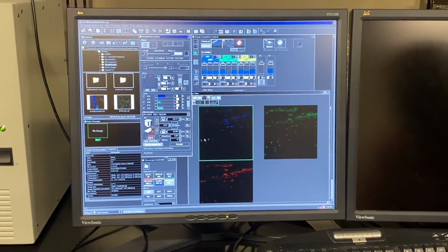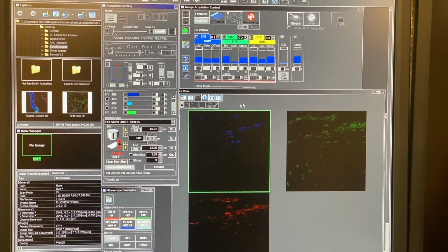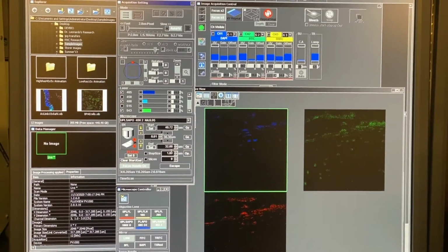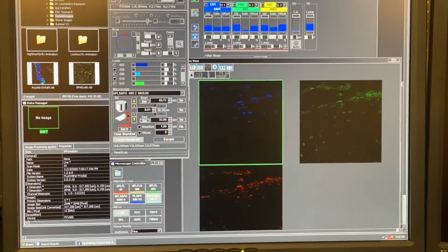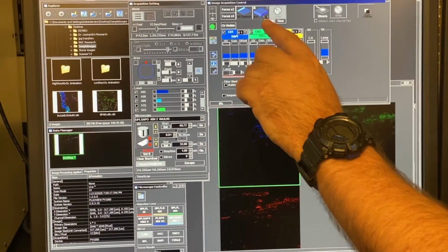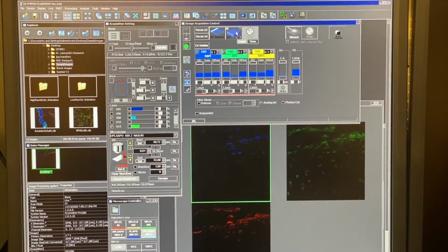So here we have all three of our dyes have penetrated to a depth of 12 microns, and we'll now be able to take these images. And what we'll do is we'll step 1 micron, so this will be 1.09 microns, so we're going to go 9 slices, 9 pieces. I'll have to turn the focus 4X off, and now I want to do X, Y, Z. So I'm going to do depth, and I'll take each of the pictures one at a time.